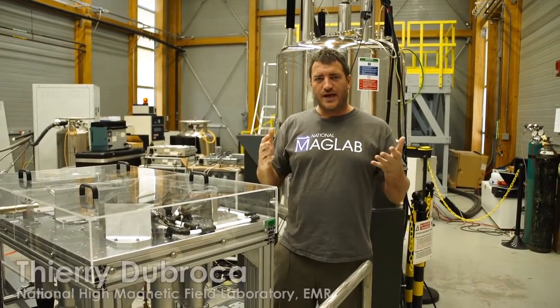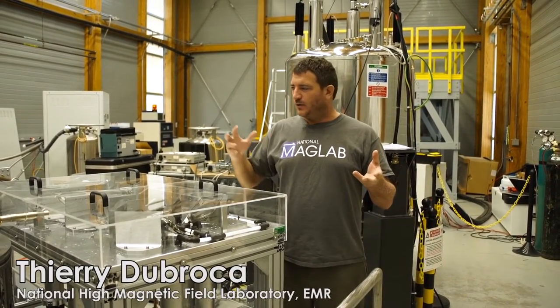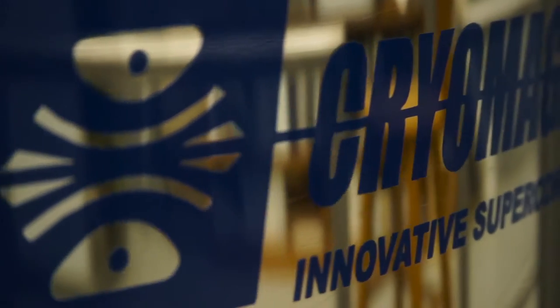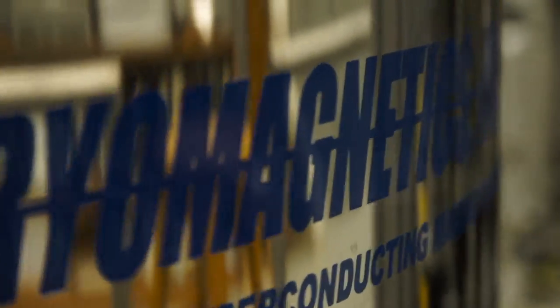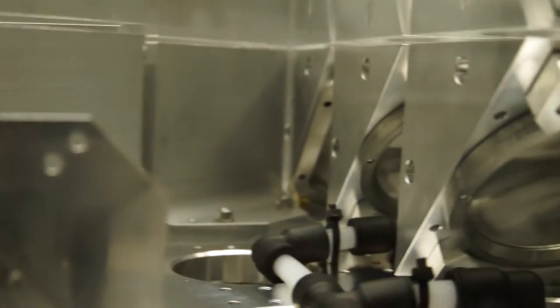Welcome to our lab. Today I'm going to talk to you about our dual DNP system. We have a gyrotron as a source for 395 gigahertz microwaves, and at the output we have between 10 to 50 watts depending on the regulation we want.